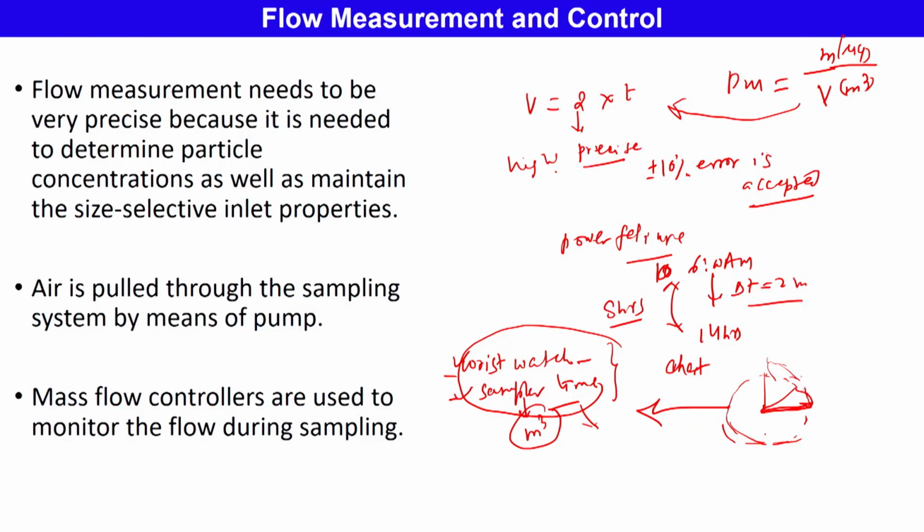So flow measurement is very important, and if you want to be more precise, you have to calibrate your pump very regularly.